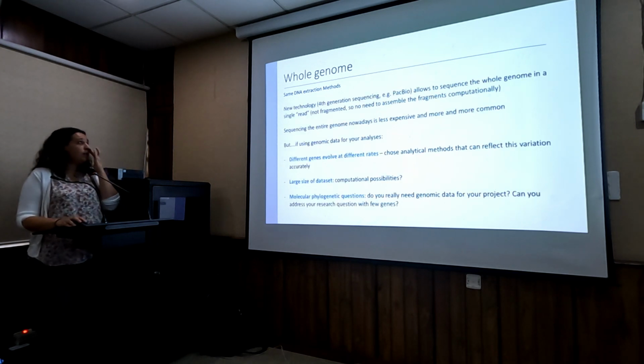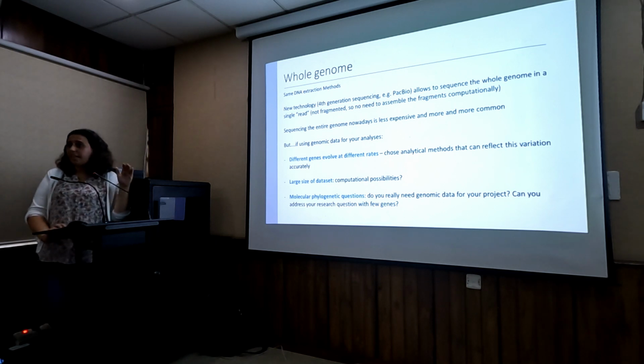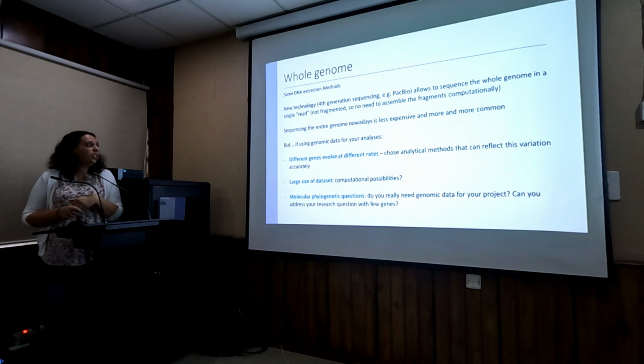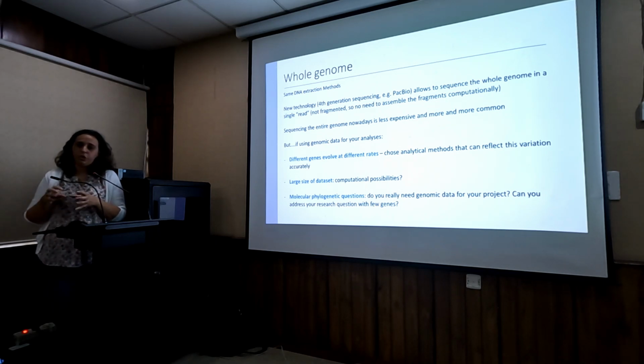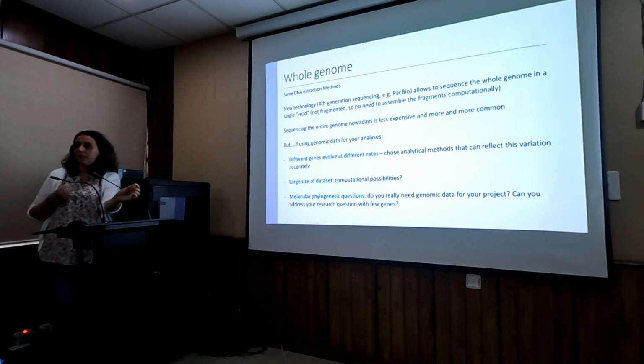So just the last one on whole genome. So we have to think about all of these. You can use the same DNA extraction methods, and it's just what you do later with it that changes. For whole genome, there's this fantastic new technology for which you don't need to assemble the fragments. It will give you the whole genome in a single read.